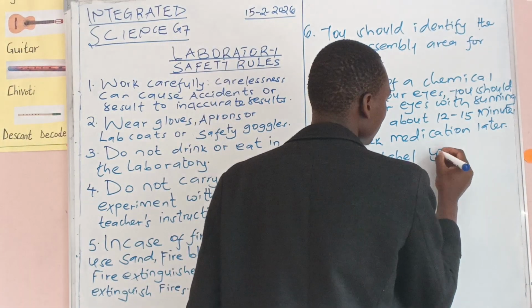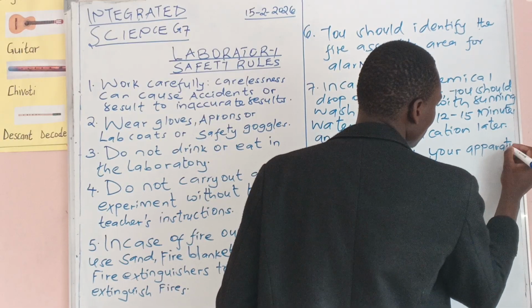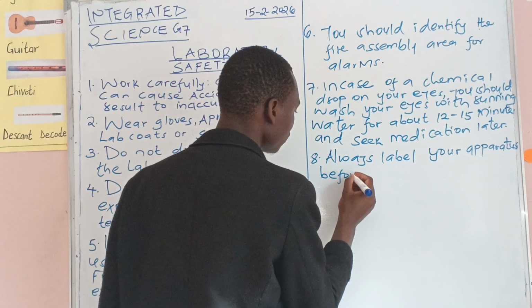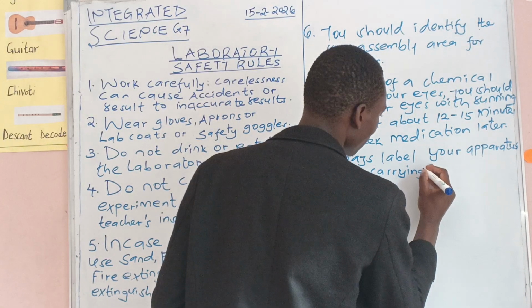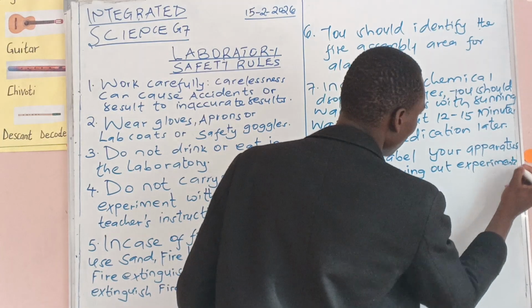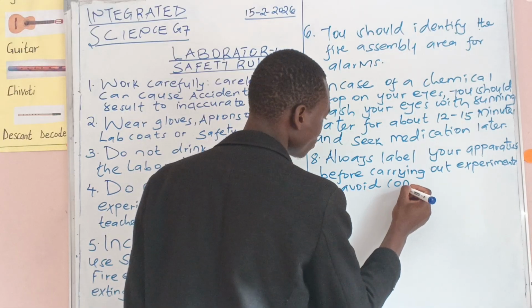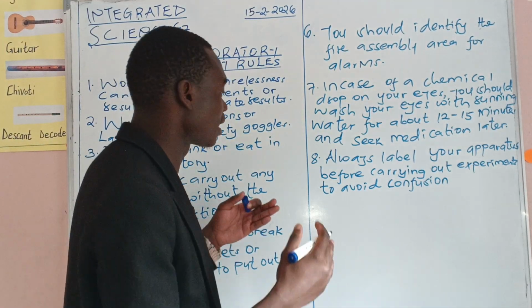Always label your apparatus before carrying out experiments to avoid confusion, and therefore for accurate results.